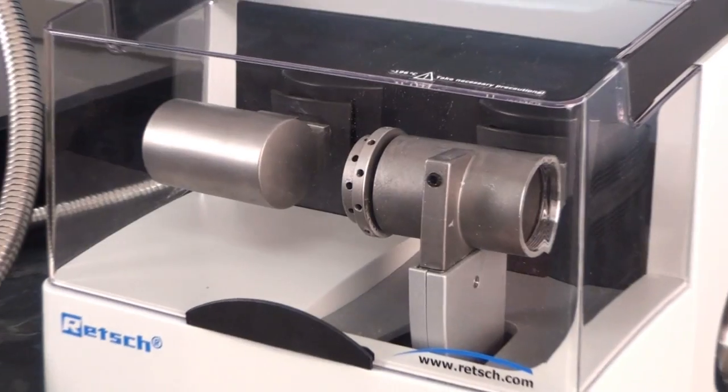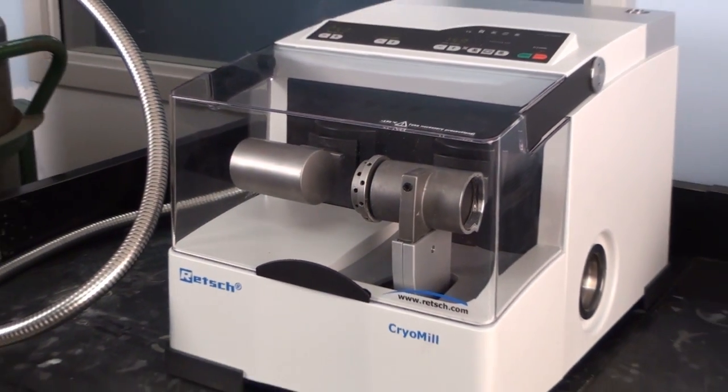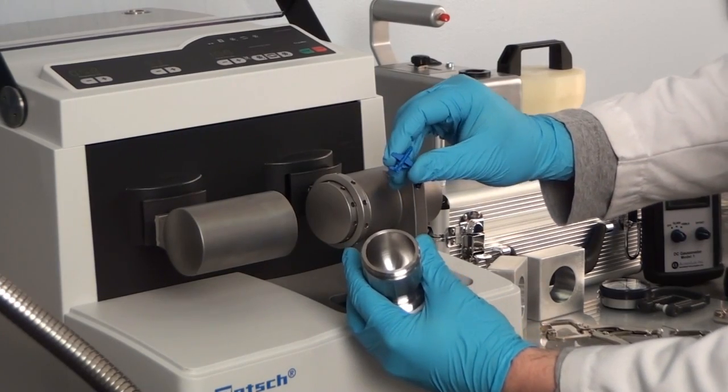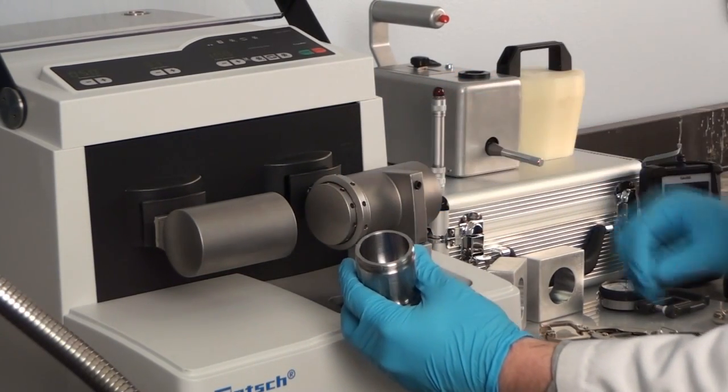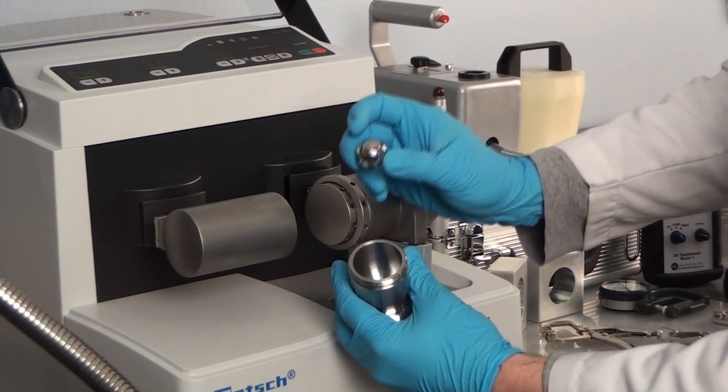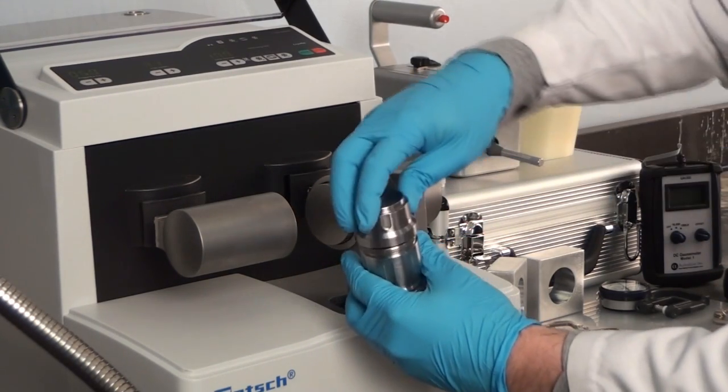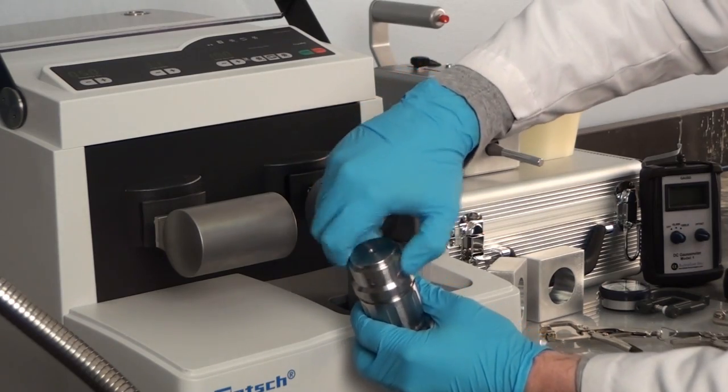The brand new state of the art cryogenic mill for the preferred CPSC methodologies of plastic substrates. Here's one of our technicians introducing a plastic substrate along with a ball bearing into the stainless steel vessel to pulverize your sample.